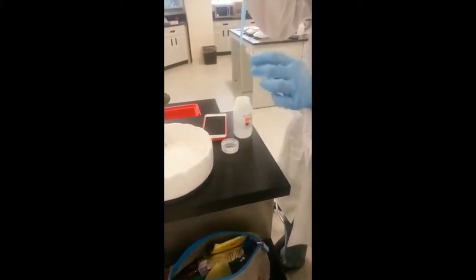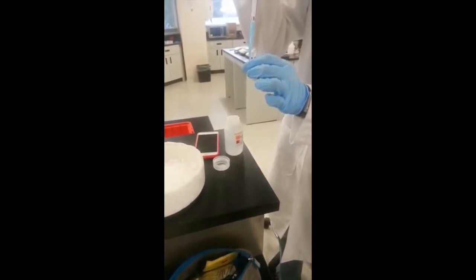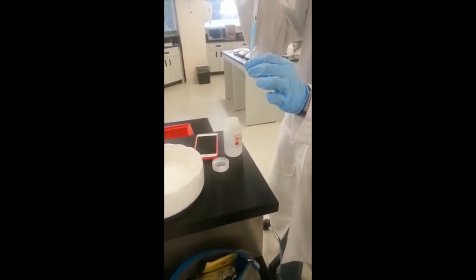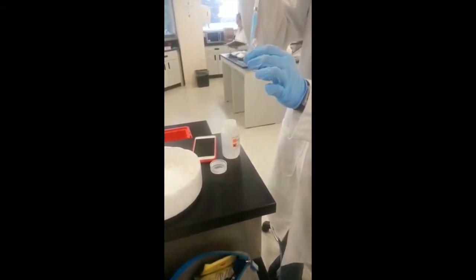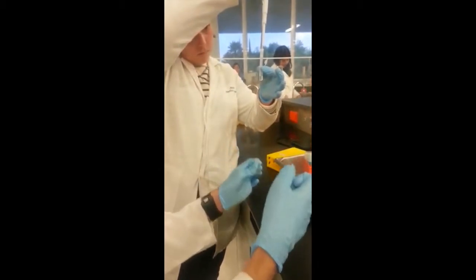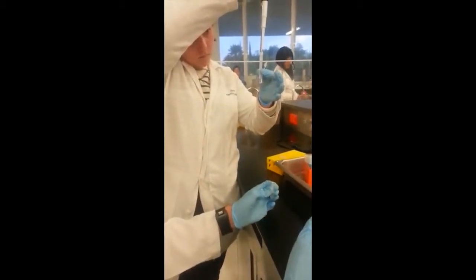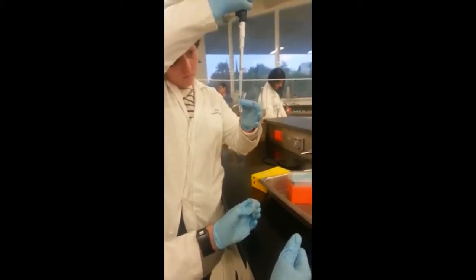There are kits that make the extraction and purification easier. Some examples of these kits are the ZR Genomic DNA kit, which uses a column purification process by DNA retention filter, completed in less than 25 minutes. It does not use proteinase K and is harmless without phenol or chloroform. Typical fragment sizes range from 25 to 35 kilobases.